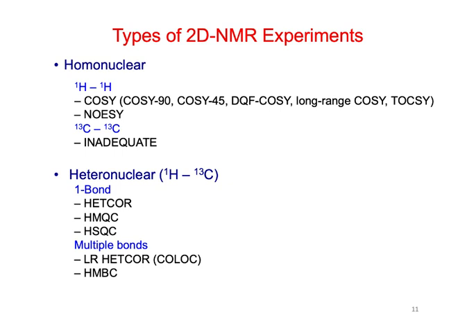They'd measure the size of these NOEs, then model the structure and calculate how large the NOEs should be. They'd have a calculated spectrum and match that to the experimental spectrum, and if the sizes of those NOEs didn't match, they would iteratively recalculate the structure until the predicted NOE spectrum matched the experimental one.